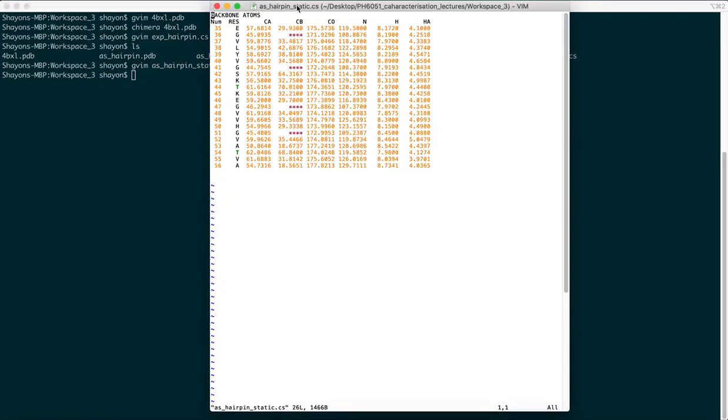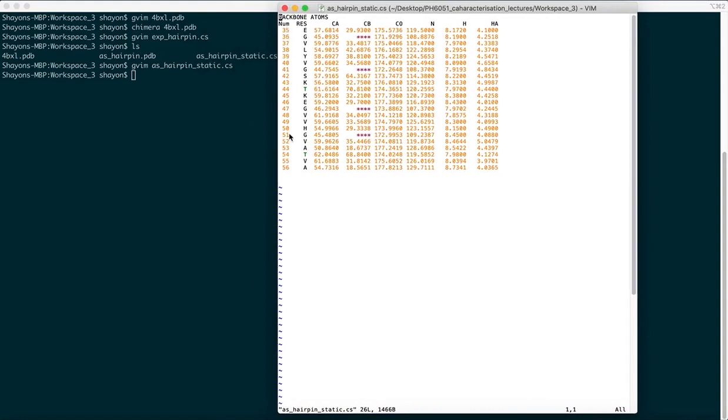If you open that, you'll find we'll have to save this column and all the corresponding columns belonging to the separate predicted chemical shift values for the atoms here. So just for the sake of this tutorial, we'll just focus on the C alpha atoms, let's say. So we pick column 1 and column 3. We'll write small awk scripts which you're familiar with already because we have dealt with it in the previous molecular modeling tutorial that we had, if you had a chance to go through it. The awk is a very powerful scripting language that could be used to process files, especially text files, easily without having to manually intervene.